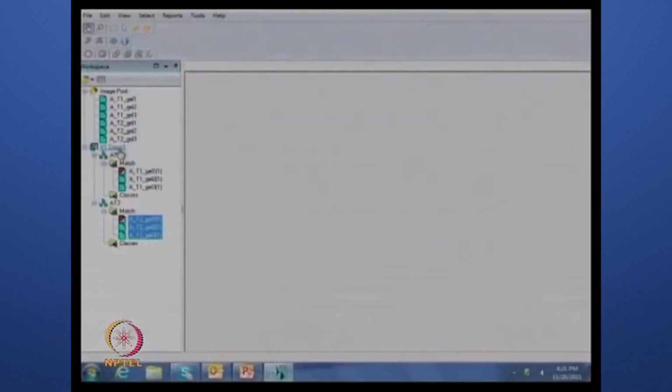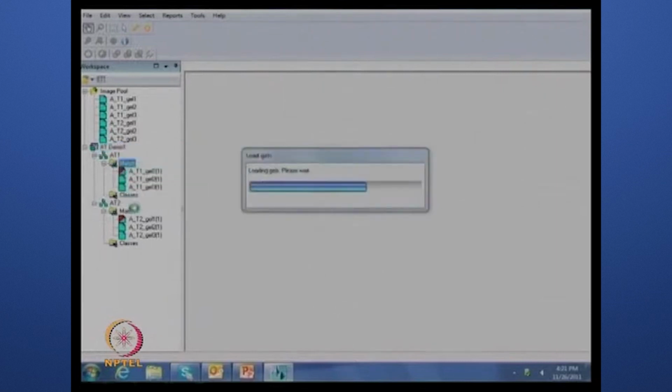So what it means is there is no bias here; one can actually change to a different reference. Now, display them. Now you have all of your gels here. Once you have the gels, we can directly detect the spots now.